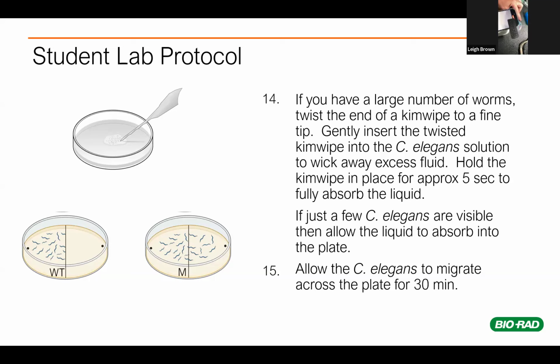They basically replace a very budget dissecting scope. This can get you 20 to 60x magnification, and it just fits over the top of the kids' phones, which is also nice, because the kids will take pictures with their phones, and now you've bought more brain space because you're on their brain device, and they'll see pictures of the worms later and show other people.